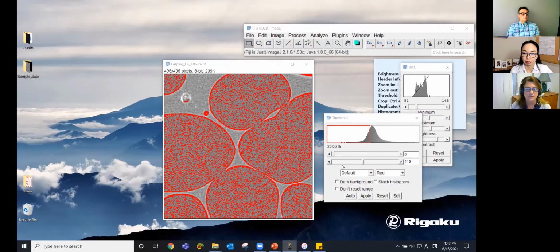Okay, so we're getting quite a few votes coming in. Give a few more seconds. We've got over half of the people voting, so another couple of seconds. I'll end it and I'll share the results. So in this case, the lead vote was for applying edge detection. Okay, it was close, right? It was very close. Second, apply smooth filter, was close too.